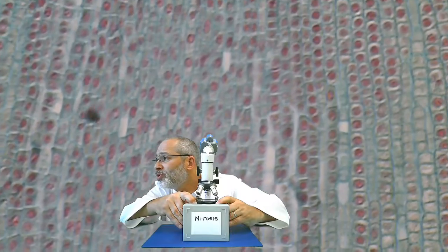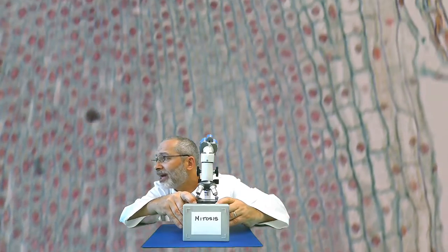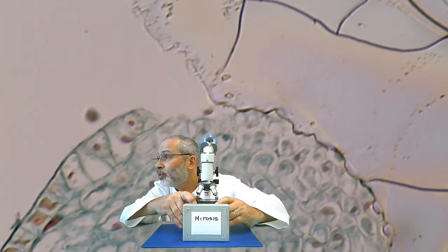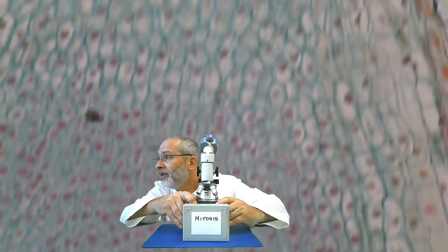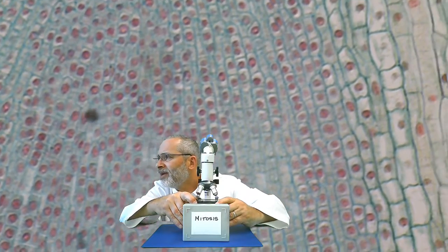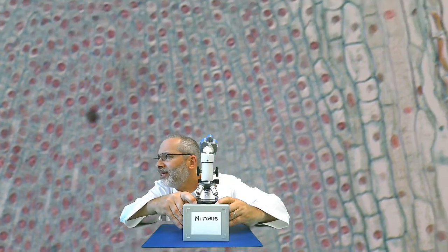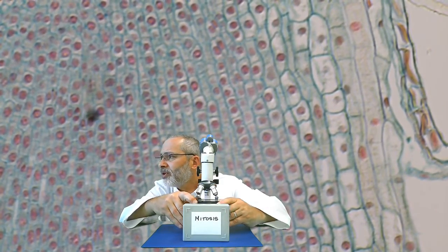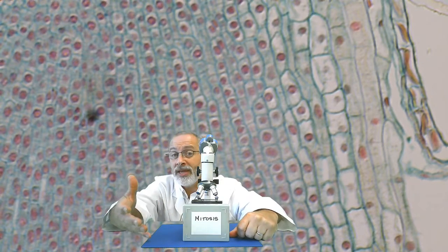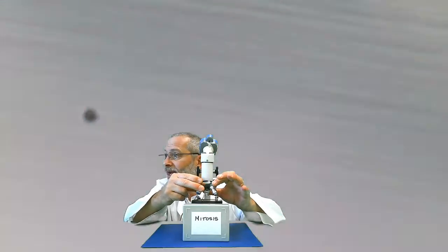And the more nuclei we see, like as we get closer to the actual tip, and I'll go all the way down here, you can see that's the actual tip of the bean root. But towards this region here, there is a big cluster of all of these nuclei. They are busily doing something. So this might be a good place for us to stop and zoom in to the medium power, which is what I'm going to do right now.